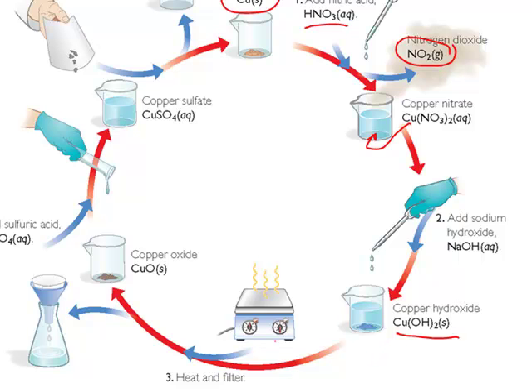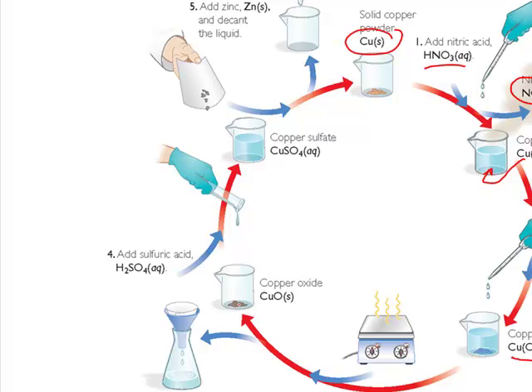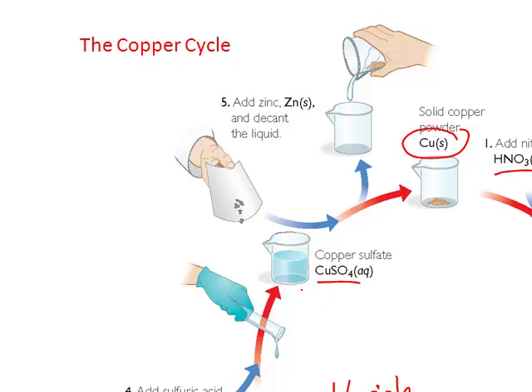After we heated it up, it changed colors from a bluish lumpy stuff to a brownish black goop for most of you. Few of you actually in this step got a bluish colored goop, this solid, and we'll try to explain why that could be. We added sulfuric acid to it and it turned light blue again, which was the copper sulfate.